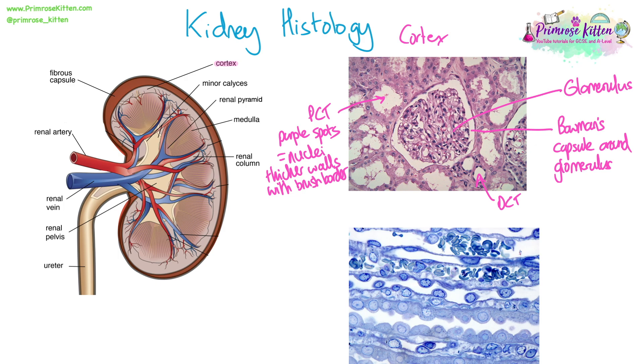The purple spots you can see are the nuclei stained in the cells lining the PCT. The medulla looks very different under the microscope.